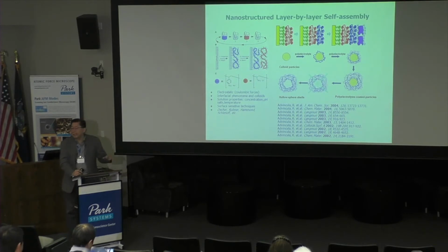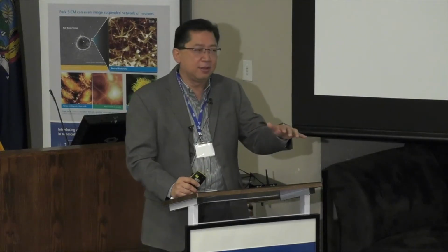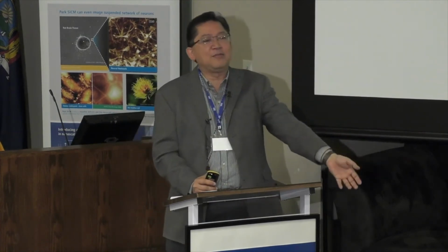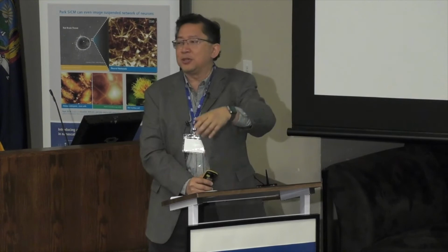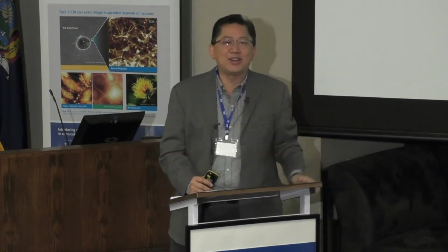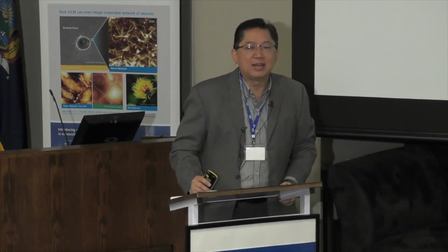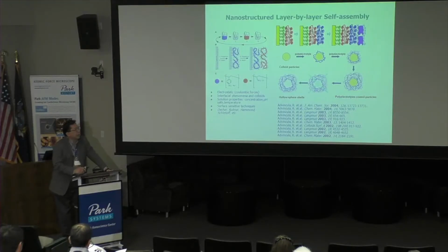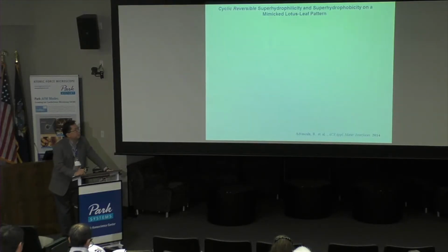polyelectrolyte electrostatic layer by layer deposition. Very simple. You do this experiment in 2 beakers, you dip your negatively charged polyelectrolyte into positively charged polyelectrolyte. You get nano layers easily, okay? Lots of undulation. And we've done that chemistry on flat surfaces and particle surfaces.